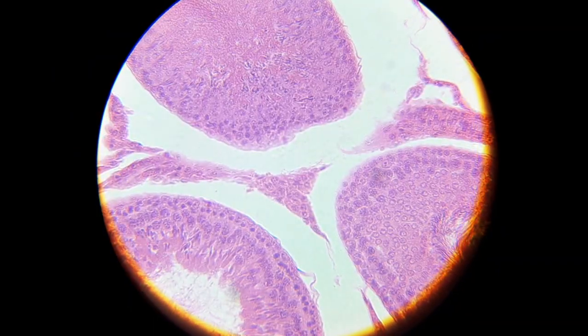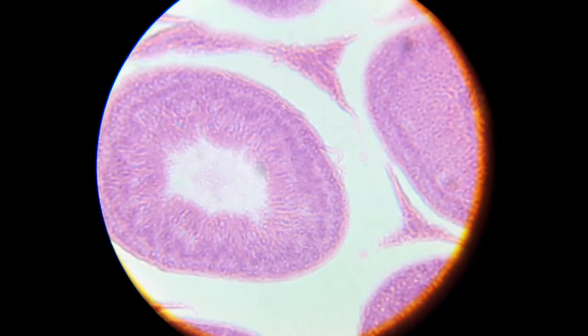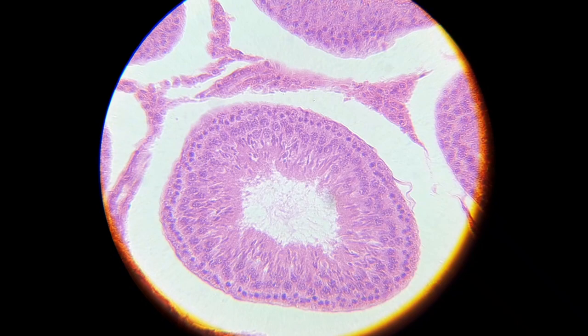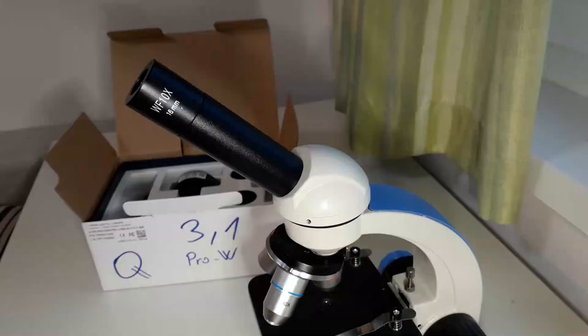And these are now, this is now the slide using the 40x high magnification. Yeah, and it's a little bit jerky because I'm moving the slide around with my fingers.